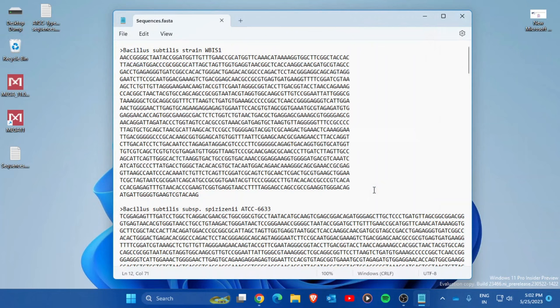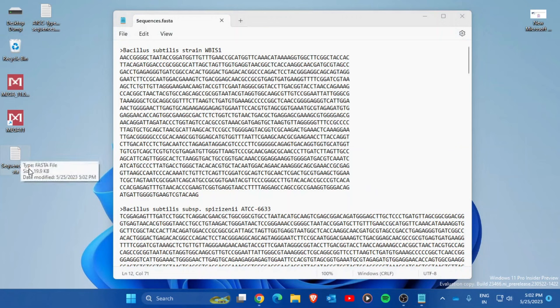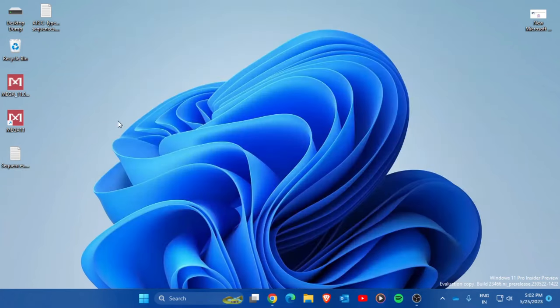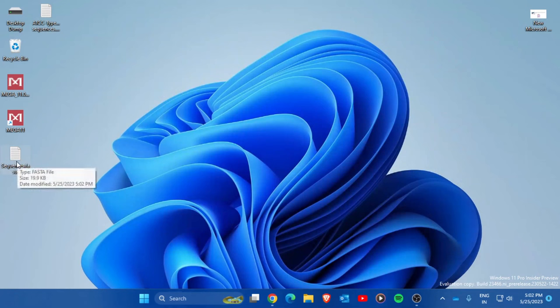Check that the FASTA file is on your desktop — it should have the extension .fasta. We need to convert the sequences into a FASTA file because the MEGA software can read FASTA format but cannot read a plain notepad file directly.